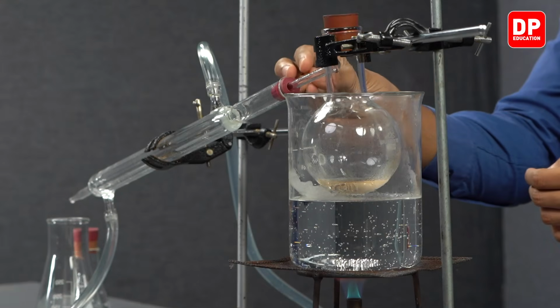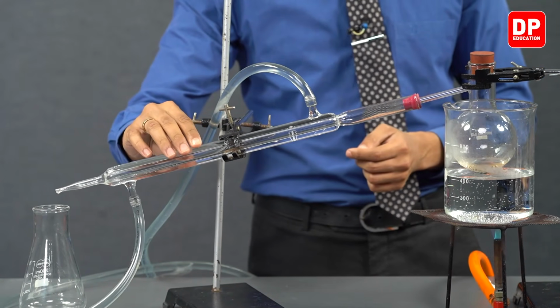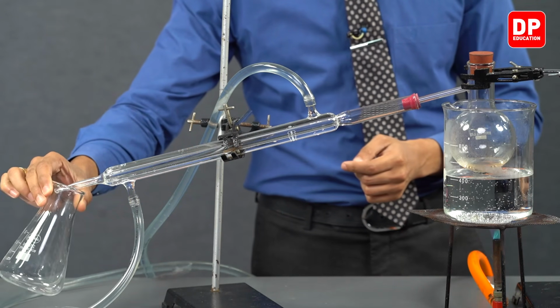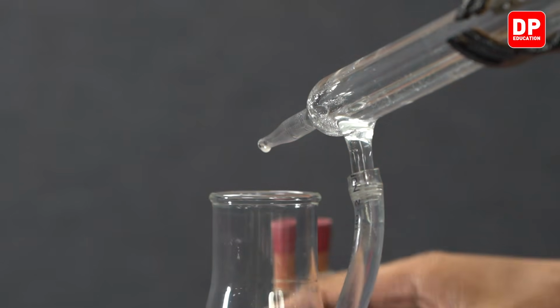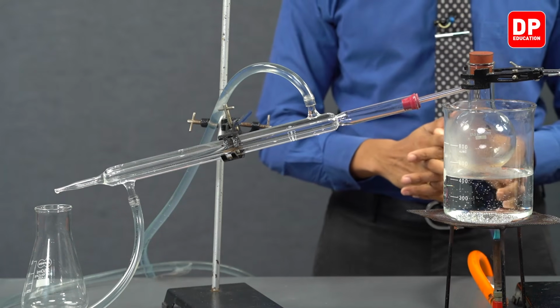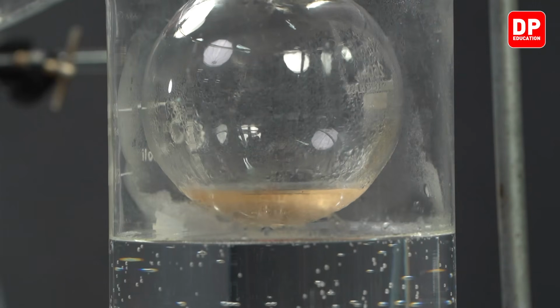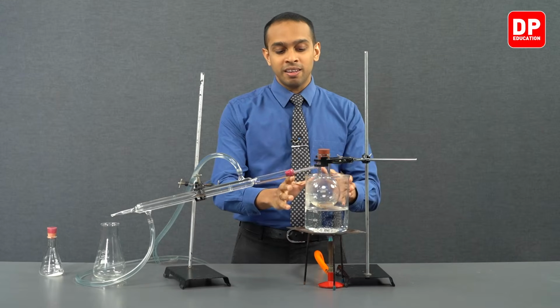That means some vapor has been produced, and that vapor will be directed towards the Liebig condenser, and we can see some amount of diethyl ether layer has gotten condensed and has come into this titration flask. So as time goes by, we will see only the essential oil remaining over here. So we will allow the system to run for a while, and we will come back and observe the essential oil remaining in our distillation flask.